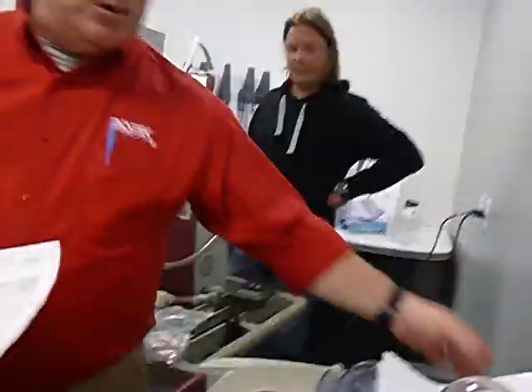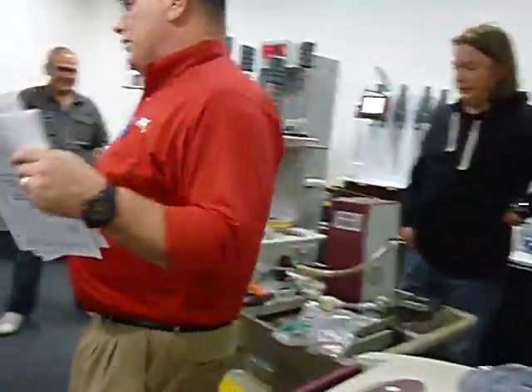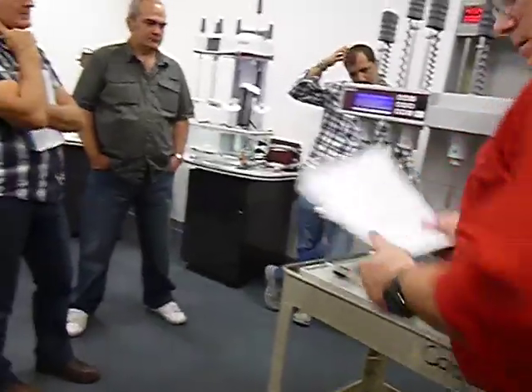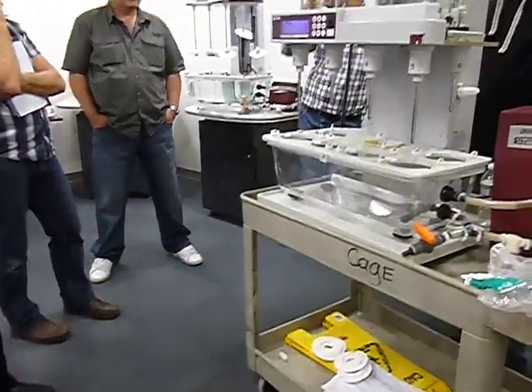And that's the PM procedure. Not overly difficult. It's basically a checklist, and it's a matter of going down it and knowing what it is that you're looking at. And that transitions us into the MQ.